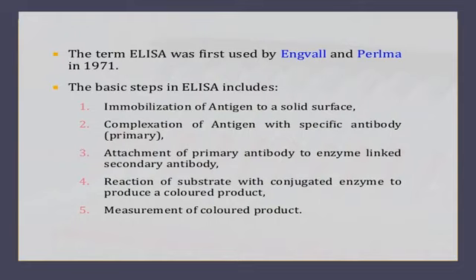Then attachment of the primary antibody to the secondary antibody, but this secondary antibody is linked with an enzyme. So it is an enzyme-linked secondary antibody.